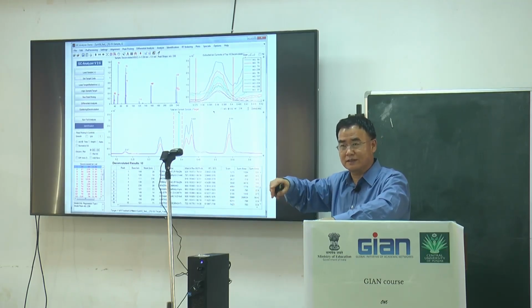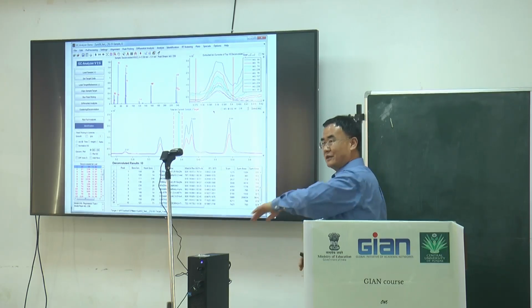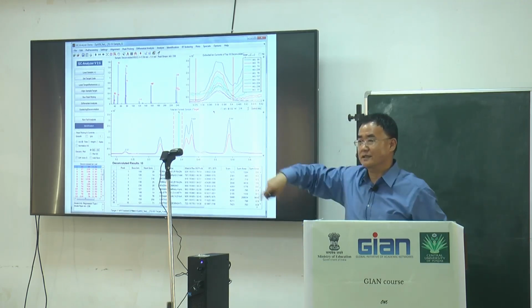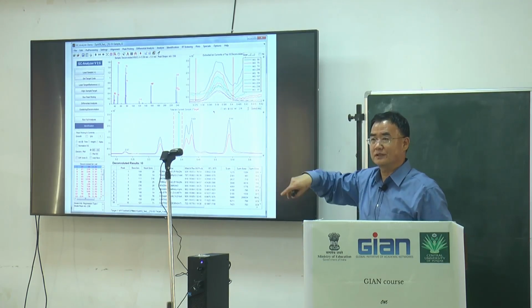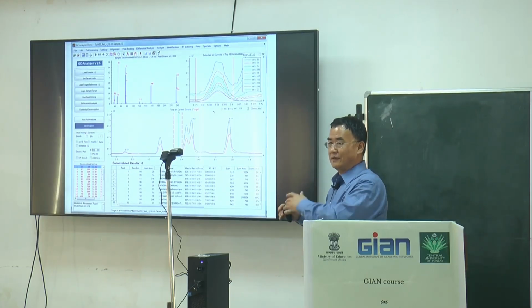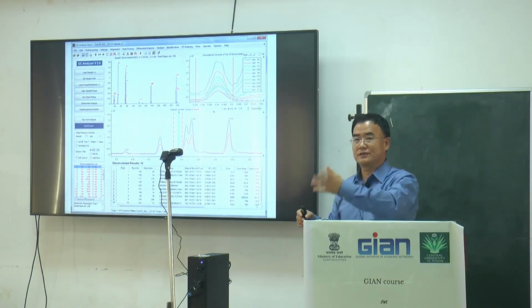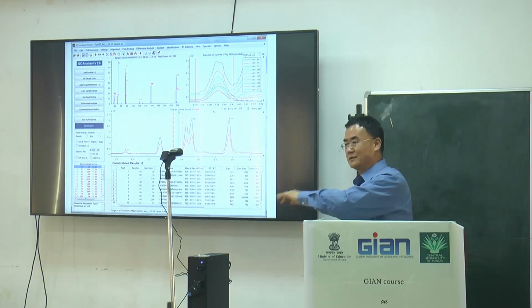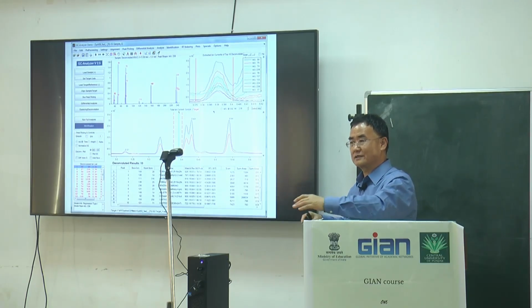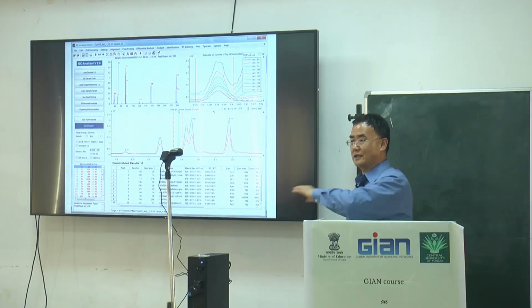Then eventually, as the temperature goes up or over time, they come out to the mass spectrometer. They are eluted out because the carrier gas continues to flow. After one sample is finished, they use high temperature to quickly clean up the capillary column again, so the attached or retarded chemicals quickly get away.